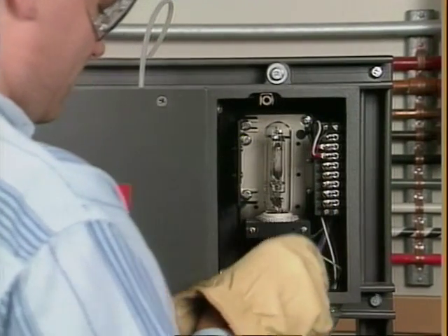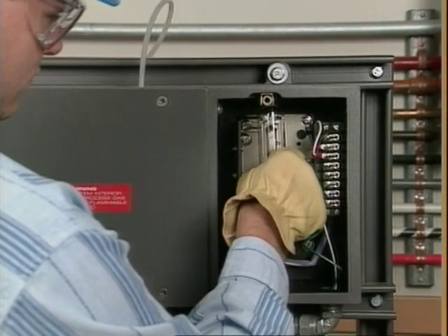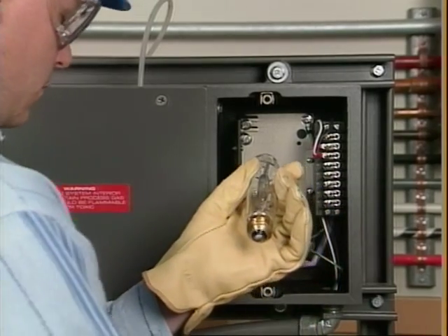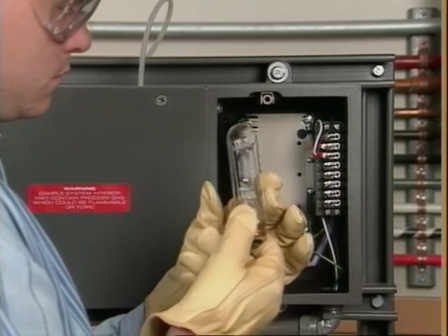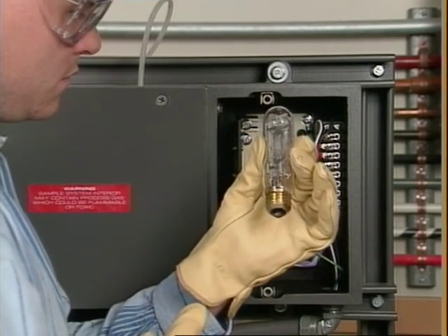Remove the lamp cover and carefully remove the old source lamp. Replace the lamp with one approved by the manufacturer for use in your analyzer. Oils or grease can shorten the lamp's life. Even oils from your fingers can affect its operation.